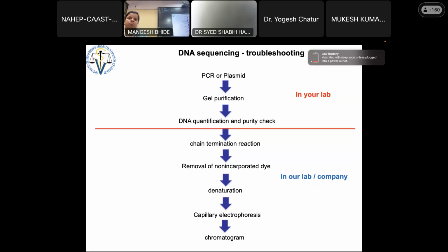Okay, so when we were trying to recycle the column, we found that after 2 or 3 cleanings it is not a good idea. So what we found is the best way is you purchase the filter, that is silica B, and it is, I think, 20 euros. How much will it be? 2000 rupees only, and it will last lifelong. It is a lot of filters, a huge quantity of filters you will get.